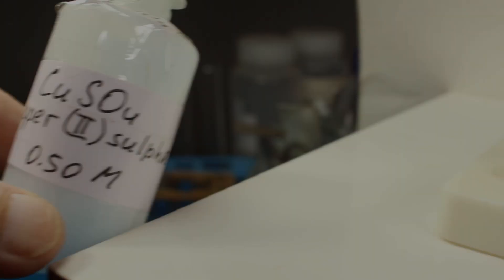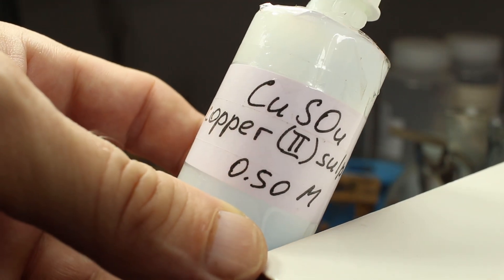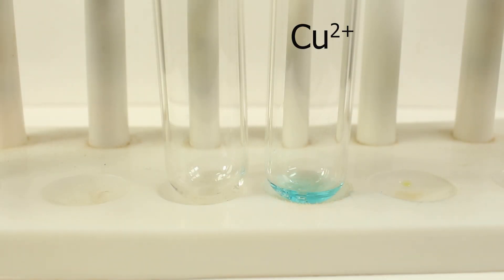Sodium hydroxide forms precipitates with most transition metals, colored precipitates of hydroxides of transition metals.